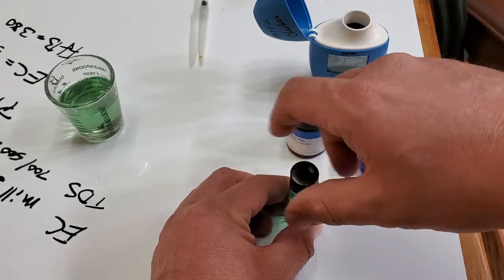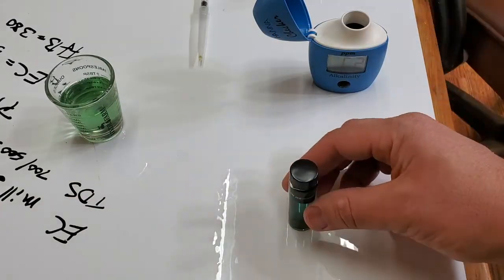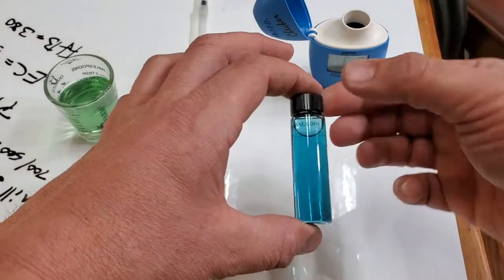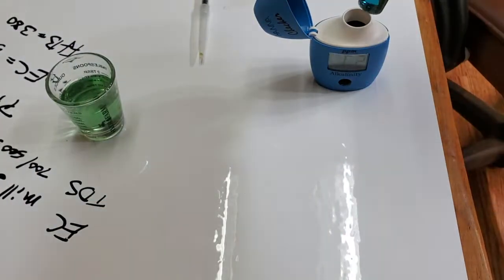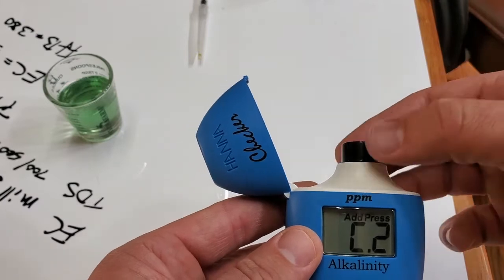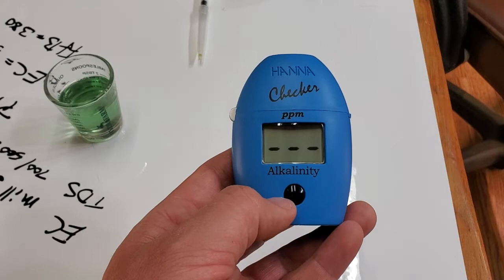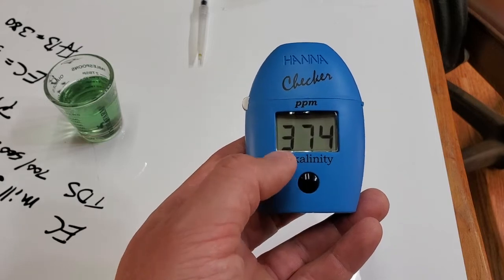Carefully make sure the reagent is mixed in with the water, but don't shake it to the point where you get bubbles. Wipe off any fingerprints, then put the vial in the meter, keeping the same orientation each time — variation in the glass can change the color reading. Also, if you have chlorine in the water, remove it first through a carbon filter or it can affect your reading.